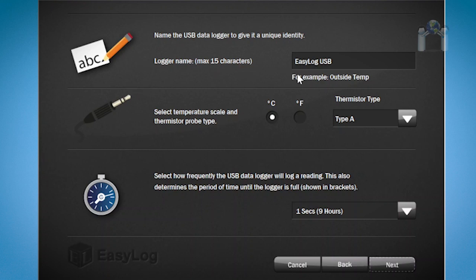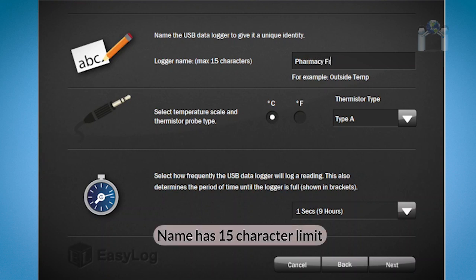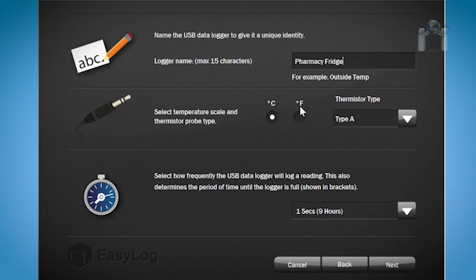The first two options are very easy. Give the data logger a name, and if you want the temperature scale to be Fahrenheit or Celsius. I will change the name to Pharmacy Fridge and change the temperature scale to Fahrenheit. You will also need to make sure the thermistor is set to Type A.